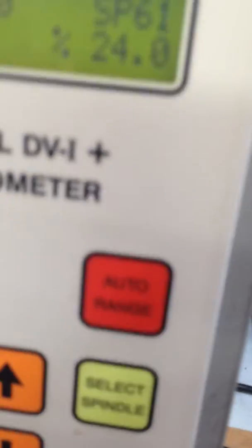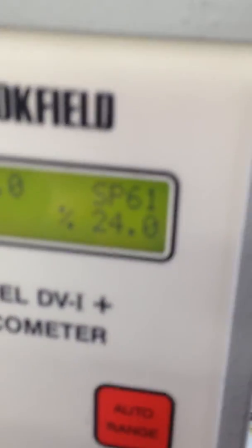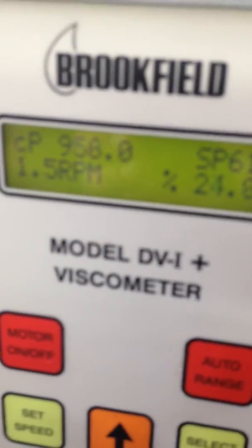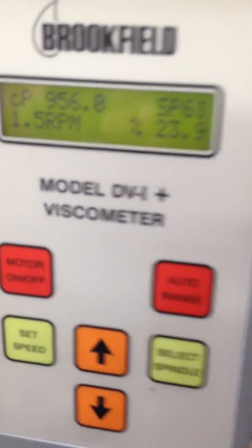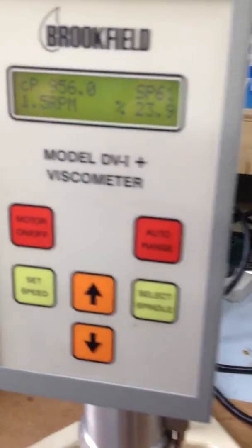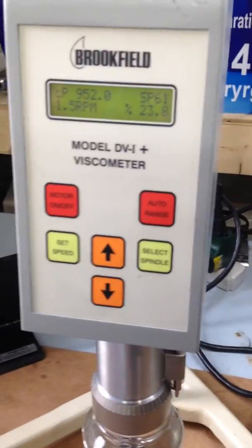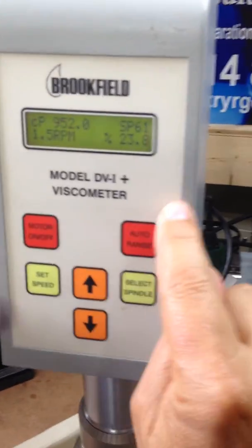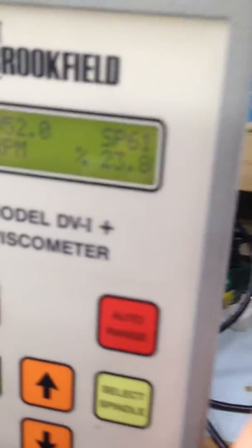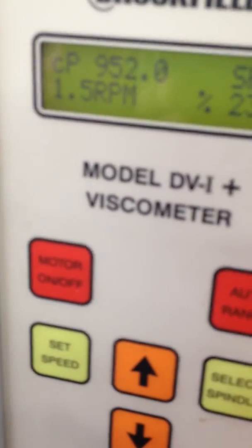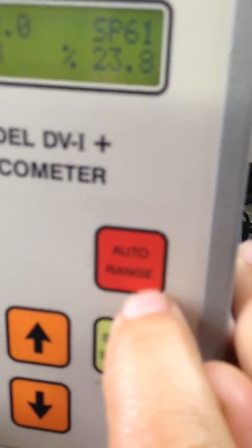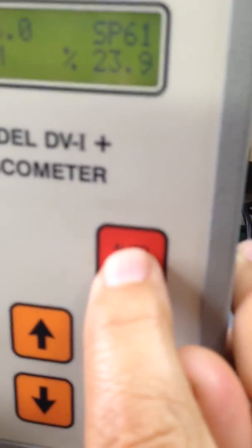You are allowed a deviation of 40 centipoise by Brookfield. If you calculate your statistics you'll see that it's 40 centipoise. Your range, if you want to go see your range, you don't have to do this but if you just want to see your range, you say what's my range, what's the maximum range.